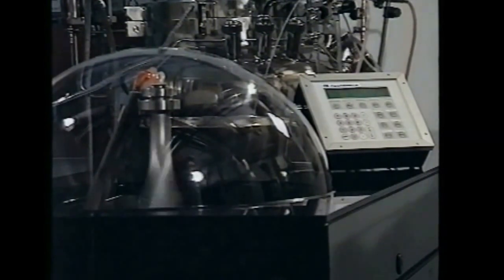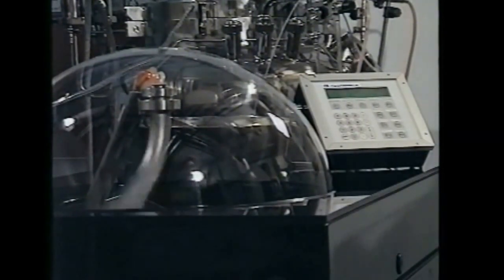The shape of the bladder and the long flow path for the suspension provide excellent separation characteristics at relatively low rotor speed.